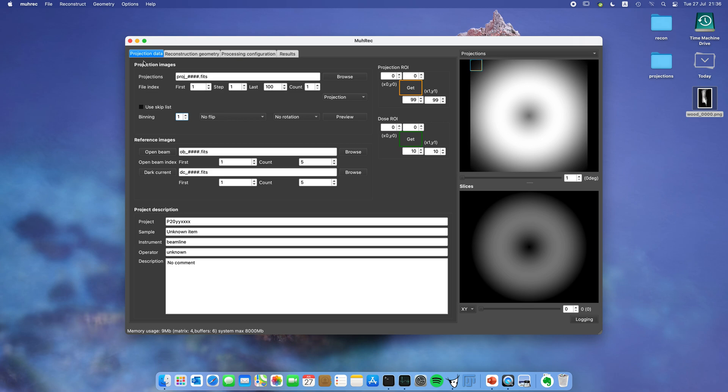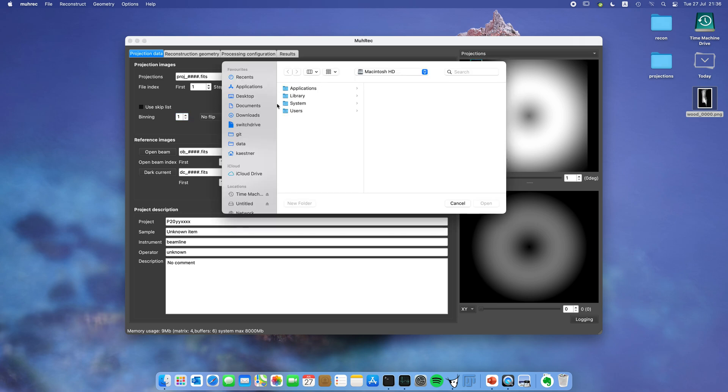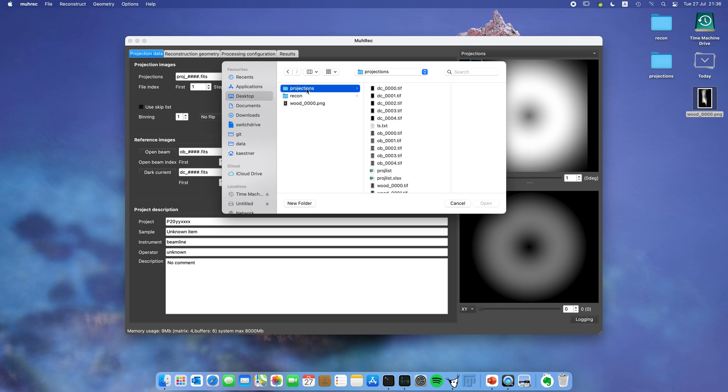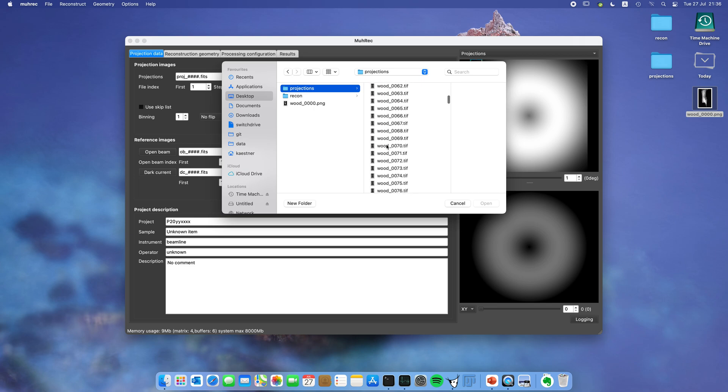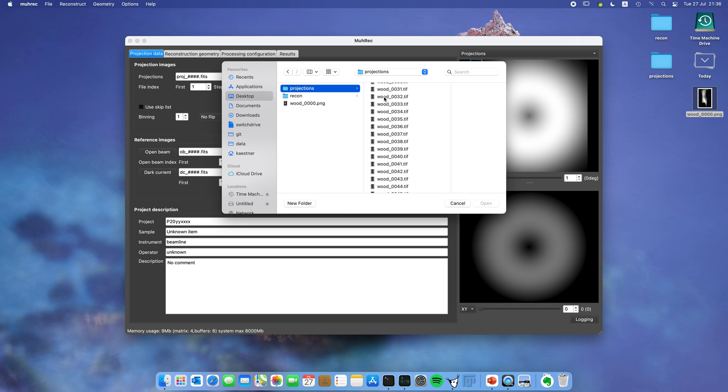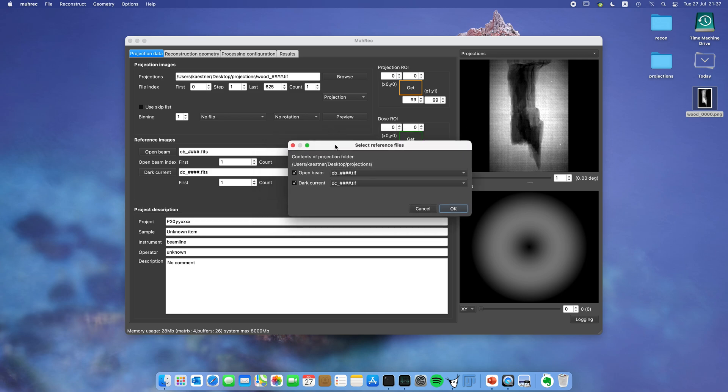We are now on the projection tab where you can select projection images and reference images. Let's look up the data. I have them on the desktop which isn't the ideal place, but anyway I have it here for the tutorial. You can see I have DC for dark current, OB for open beam, and wood projections of the sample. Now I selected the projection data. I click on one of these projections and you can see it pops up here on the screen.